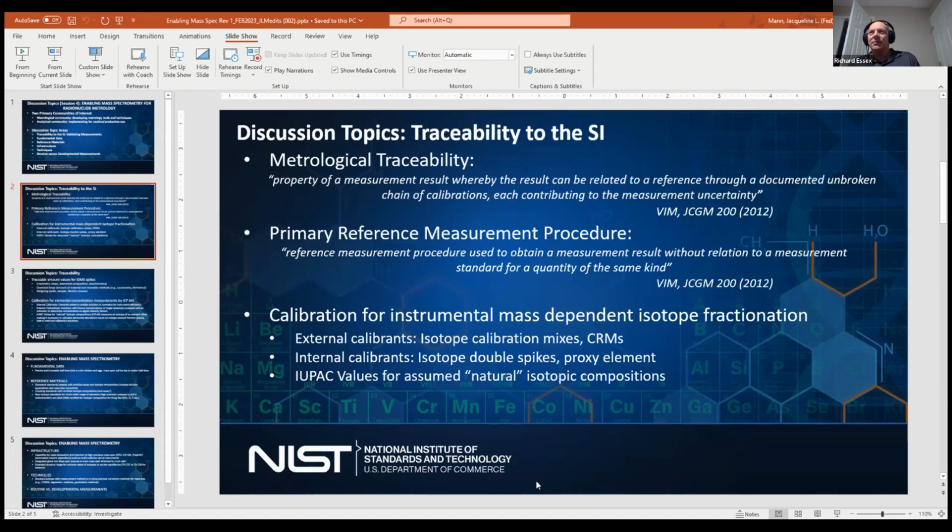But for most other elements, a lot of times what people are doing is they're taking what they assume to be natural, use the IUPAC values, which give sort of a best measurement, but they also give sort of the observed range. And whenever I go to that, I generally use that observed range value as an uncertainty on the value I'm using. So I guess that sort of covers the natural variation, or even some measurement variation from the various people who've looked at these things.